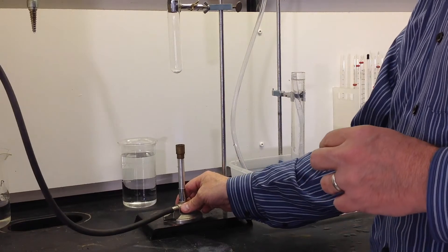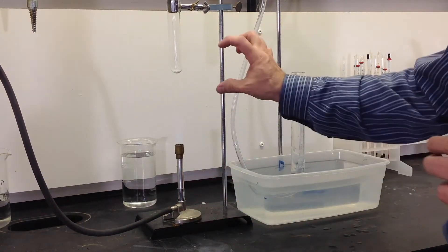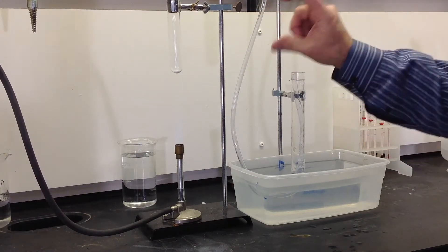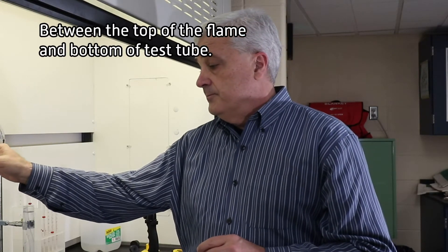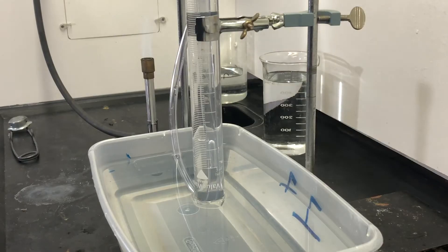I'm leaving about 10 centimeters between the flame and the test tube. I want it not to go super hot, super fast, but I want it to get hot enough to begin the reaction. The first thing we're going to see is the air inside the test tube is going to expand and we're going to begin to see bubbles go through. Those bubbles are going to fill the graduated cylinder and the water level is going to go down, which means that the amount of gas collected is going to go up.